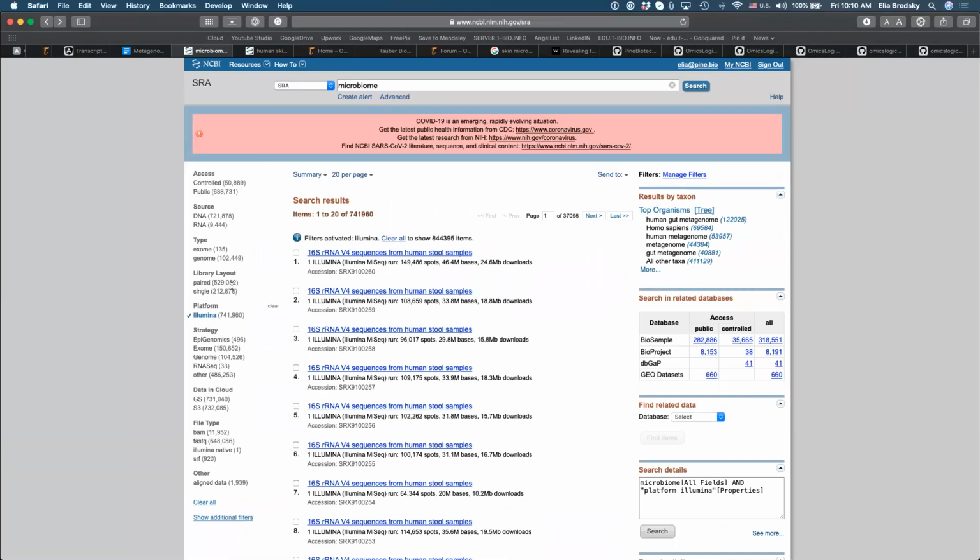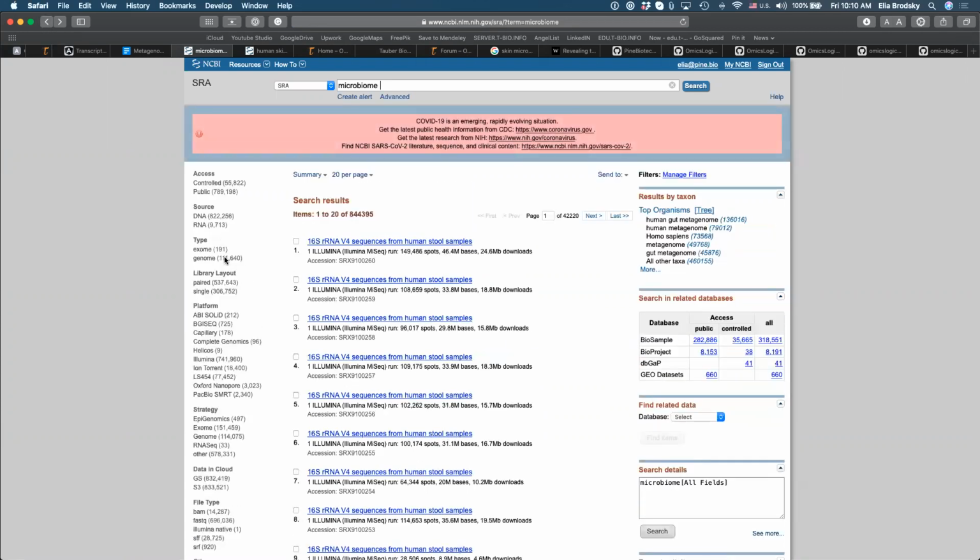But in some cases, that's one way that you can find those. And also, before you get to this place, you can also look for, let's see. And JDeb, are you looking specifically for 16S, the whole gene, or are you looking for whole genome or metatranscriptomics? What exactly are you looking for?